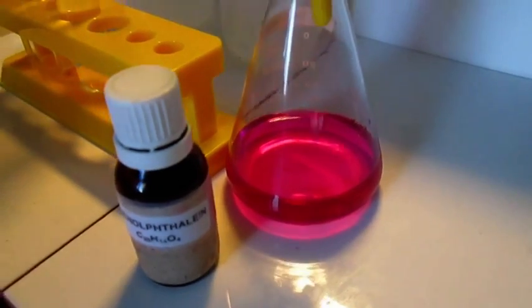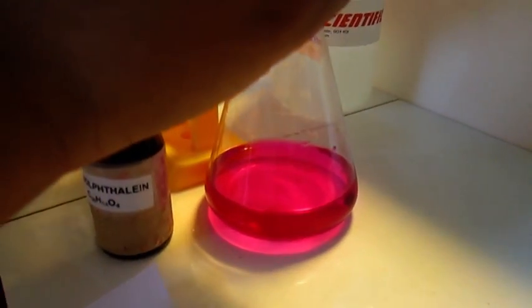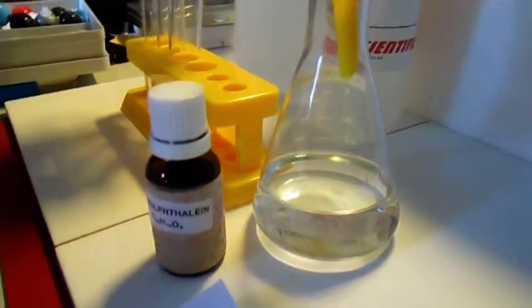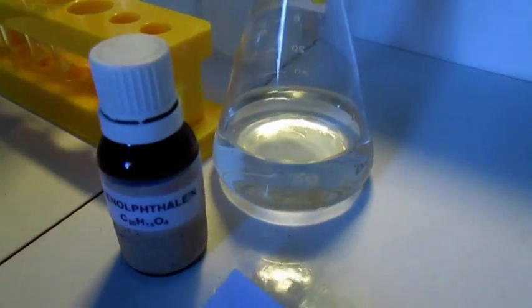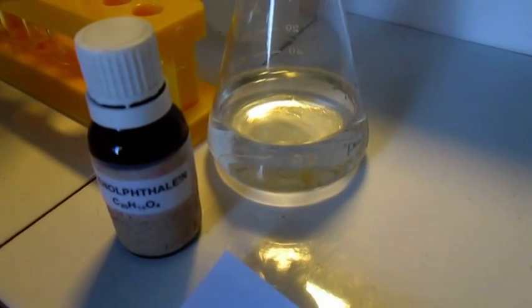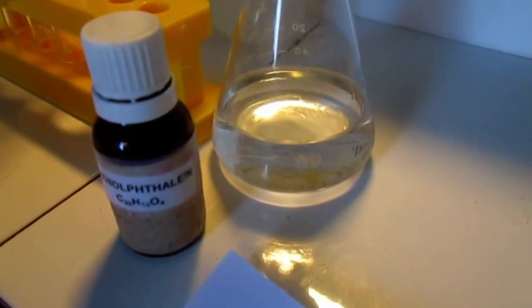Then we add hydrochloric acid into the flask. You can see the pink solution now becomes colorless again. This is because the solution is no longer alkaline due to the addition of the acid. Phenolphthalein is colorless in acid solutions.